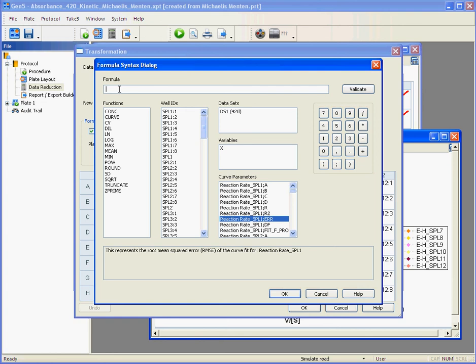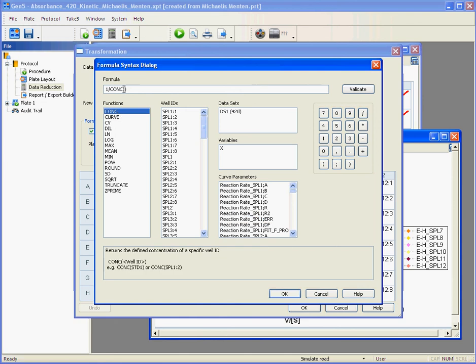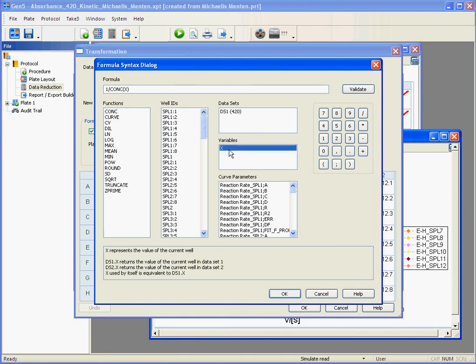So an example of creating a formula here would be done like this. You select what you want to do, your functions, and what you want the function to apply to.